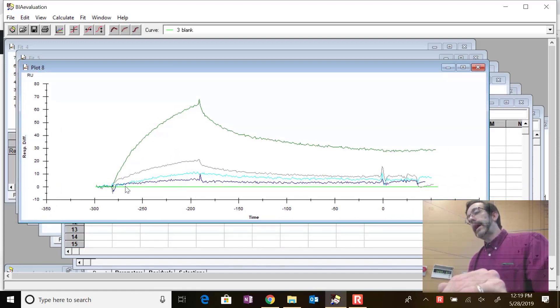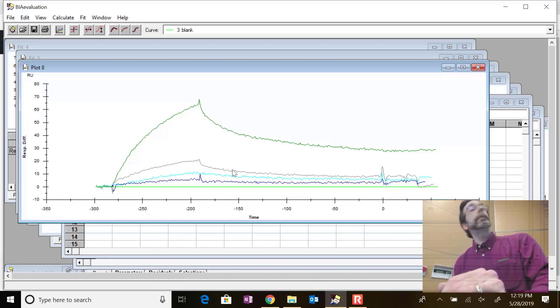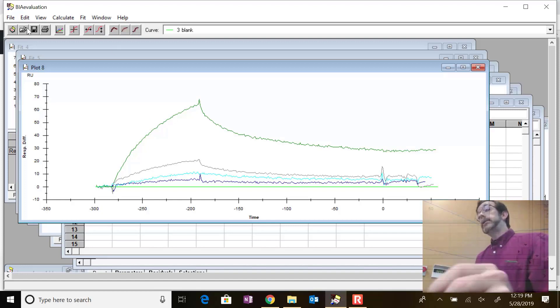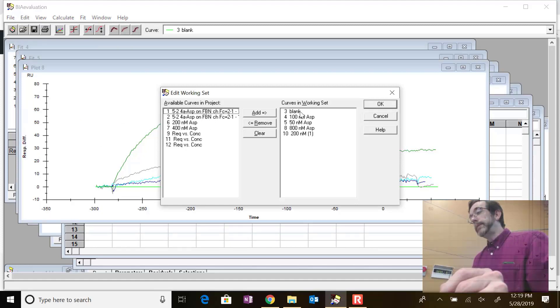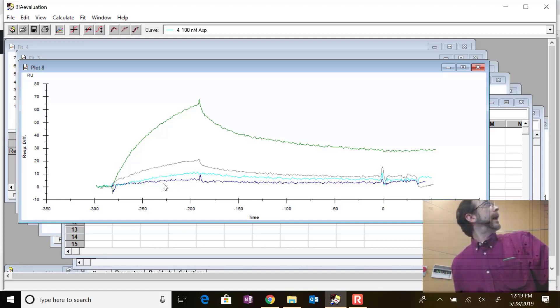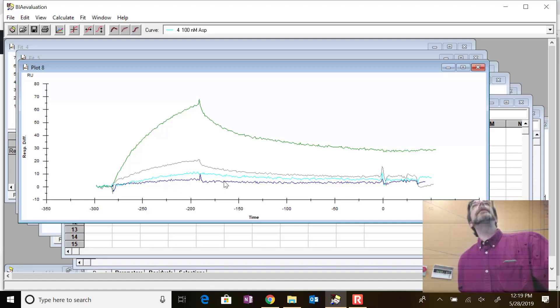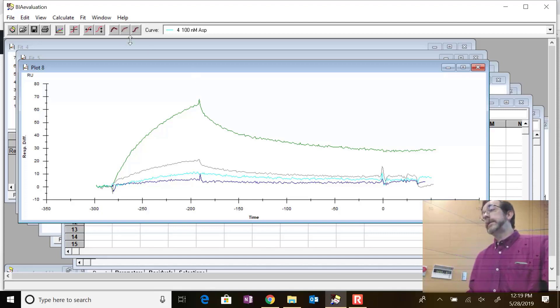You find the plot that has the best shark fin shapes. If you have one that doesn't really look like a shark fin, you can get rid of it. I'll show you how to edit the working set, because we still have the blank down there. The important thing to look at is whether you actually see a curve in the bottom data. These are on the dilute end of what we usually do, so I'll look at this one questioningly as we try to fit it.